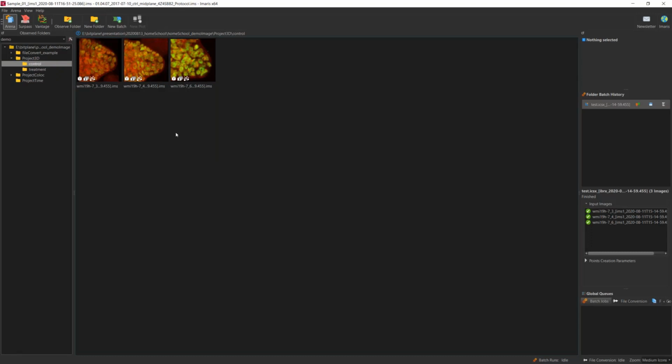But of course, there are cases where the cell size in the control group and in the treatment groups are so different, and what you are more interested in is, for example, counting the number of cells rather than determining the size of the cells. Then in that case, you might want to change your parameter based on the image so that you can capture the quantitation that you're looking for more accurately. But in general, we do want to keep our parameters as consistent as possible.